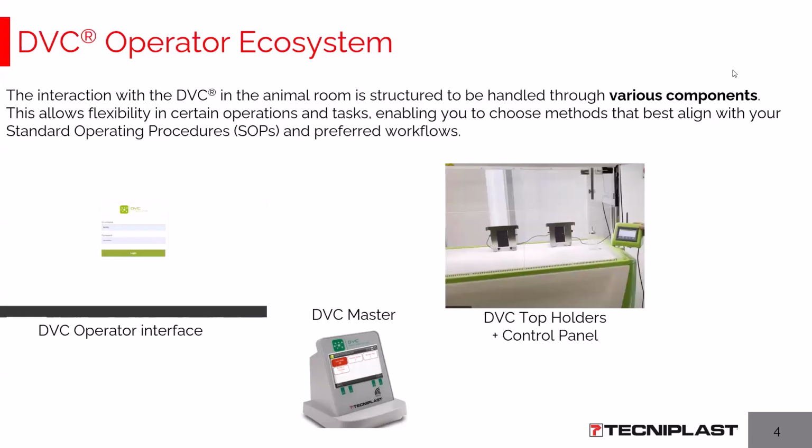that have been developed in order to provide, as you can probably see from this small picture, a third interface, the interface provided by the control panel while working under the cabinet over the working bench.